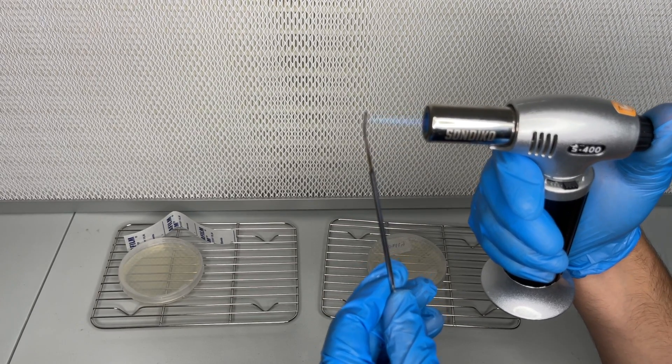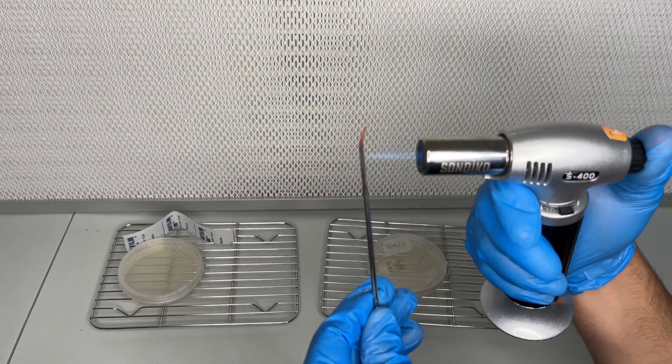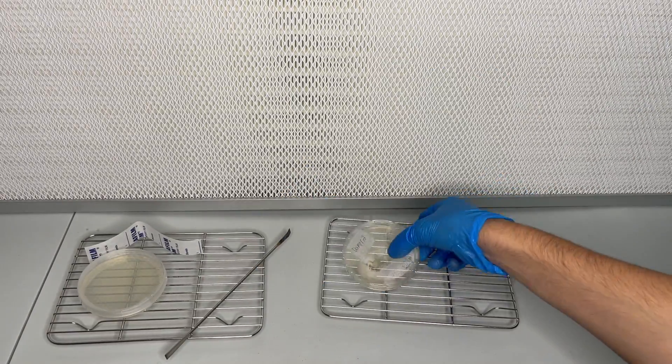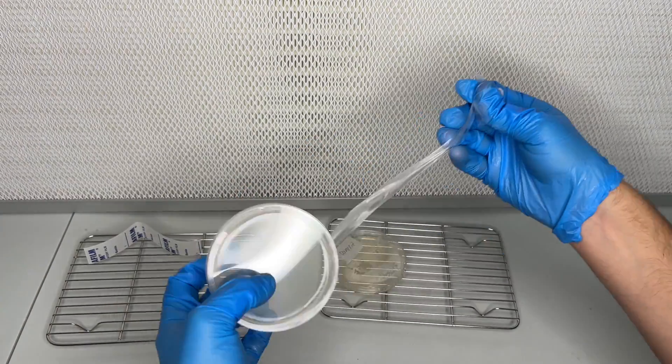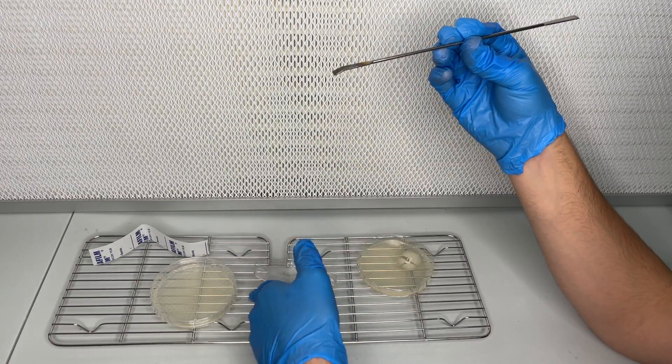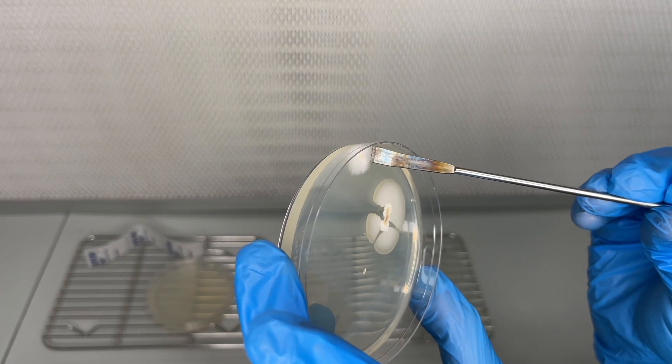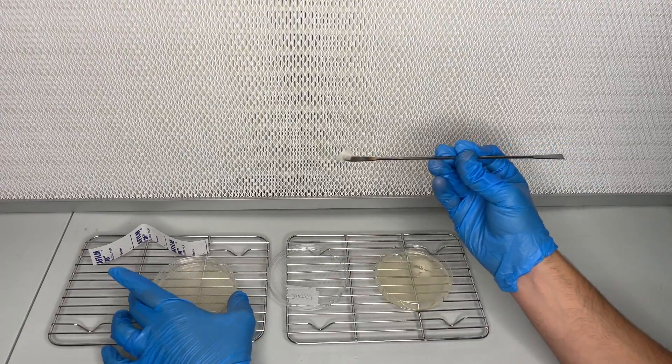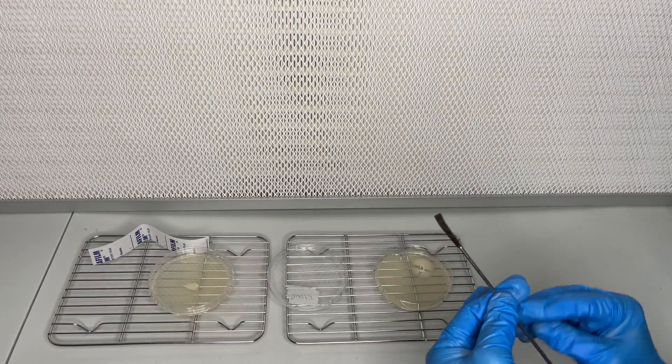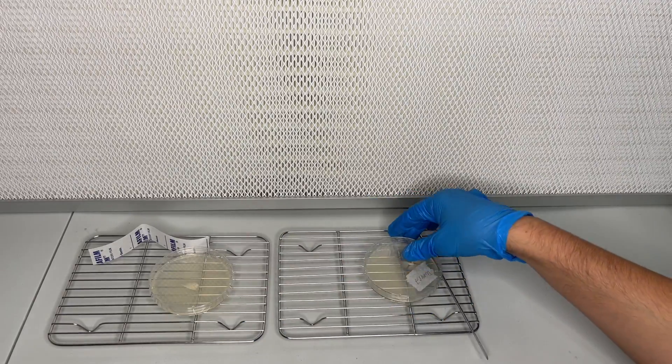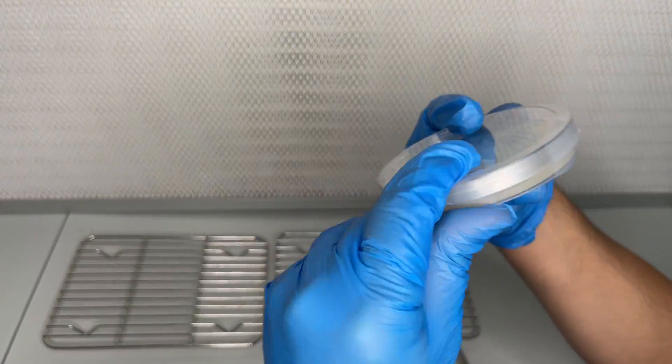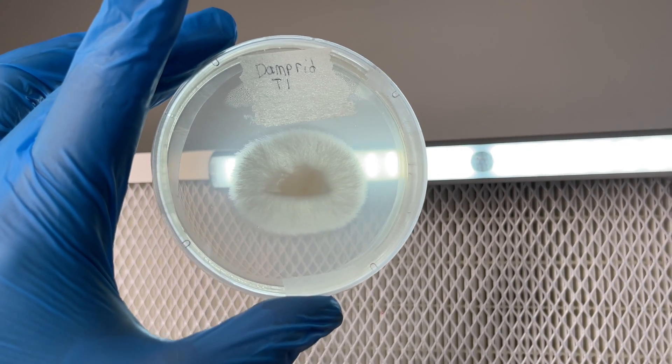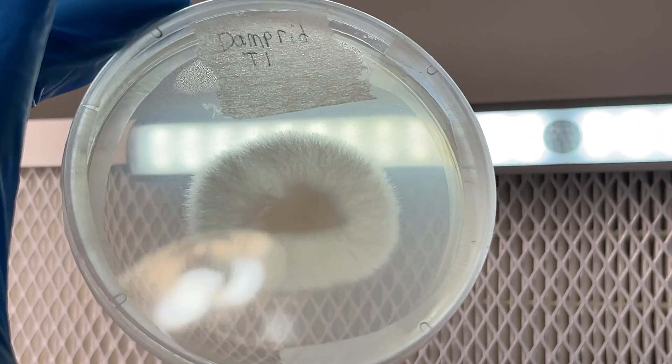I flame sterilized a metal tool and transferred the piece of mycelium to a new agar plate. After transferring the piece of mycelium to a new agar plate I wrapped it in parafilm and allowed it to incubate at 75 degrees Fahrenheit for two weeks. I was happy to see that I was successful in transferring the clean mycelium to the new agar plate.